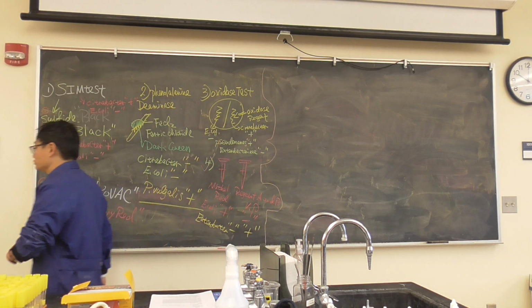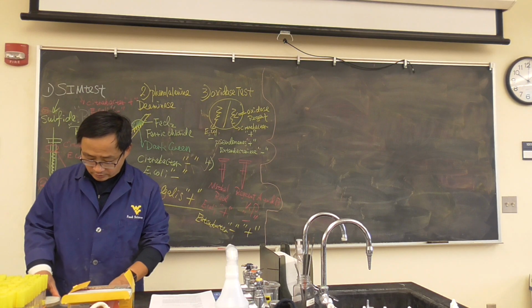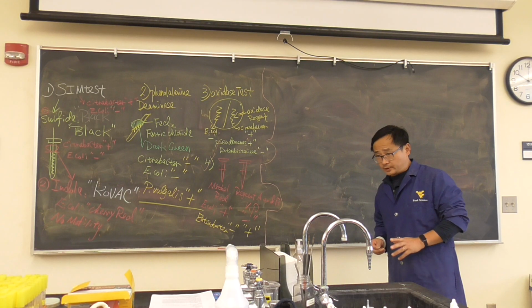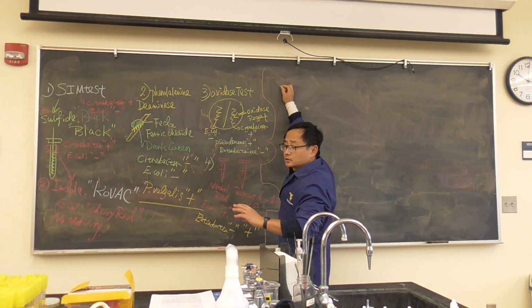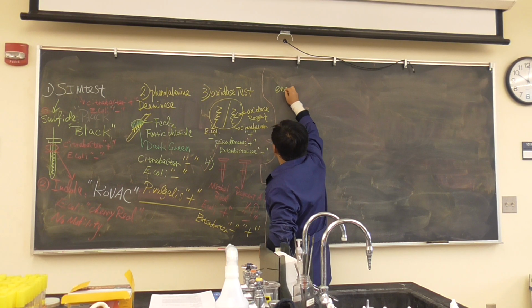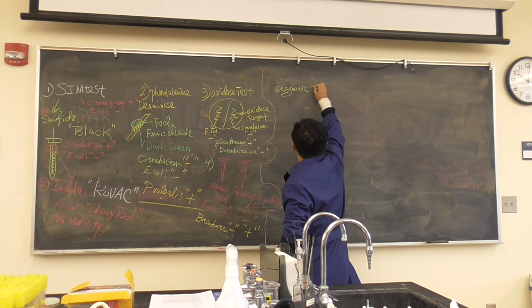Okay, let's move to today's work. What we're going to do today is relatively easy, but something we want to mention. Bacteria can use sugar, which is carbohydrates, as an energy resource, but they also can use other materials, macromolecules, as an energy resource if they have enzymatic function. So we say enzymatic test.